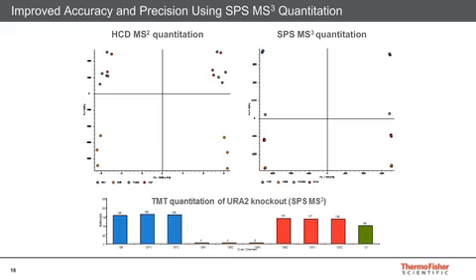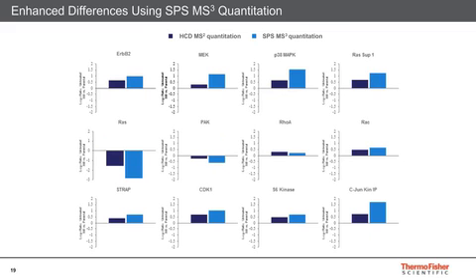This method dramatically increases the signal intensity of the reporter ions while removing co-eluting interfering ions. The increase in reporter population improves the ratio accuracy due to better counting statistics, and at the same time boosts the sensitivity limit of the peptide quantification. The advantage of this can be observed using a specifically designed TMT quantification standard. This standard consists of 3 different yeast strains that have a single gene knockout, labeled in triplicate with TMT11plex reagents, as shown in the reporter ion bar graph at the bottom of the screen.